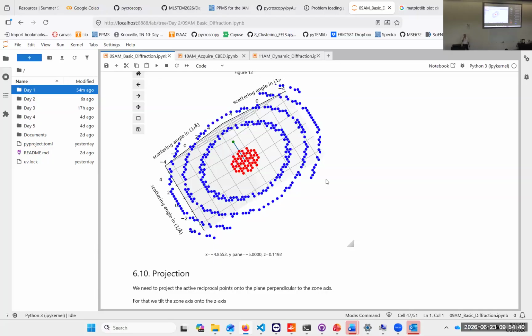And if you look at that down, say, one of the corners, the space diagonal, then you see something that is 6-fold. And so looking at the symmetry of your diffraction pattern directly tells you what kind of symmetry your sample has in different orientations, or in the specific zone axis where we are. So we want to see that on the microscope in a little bit.